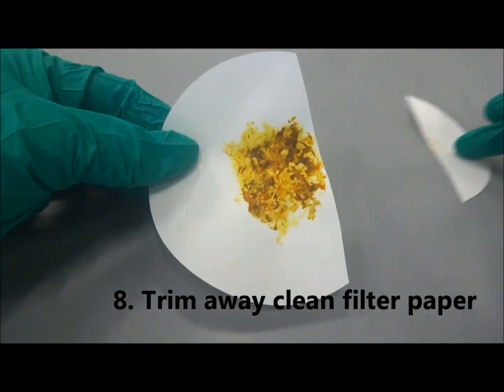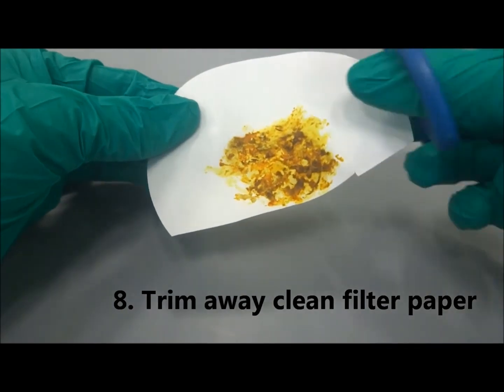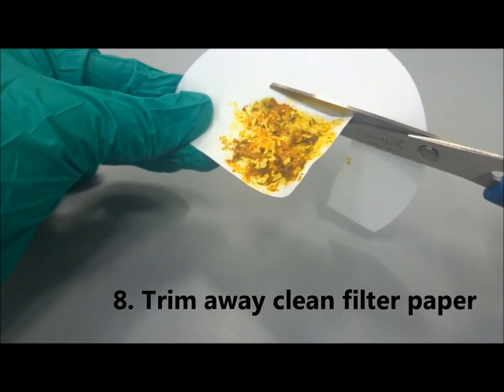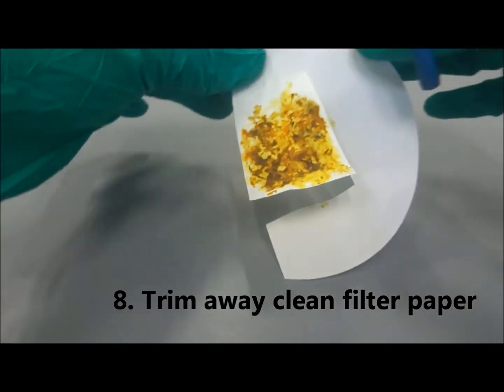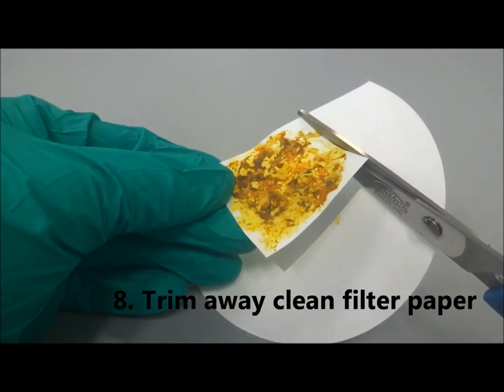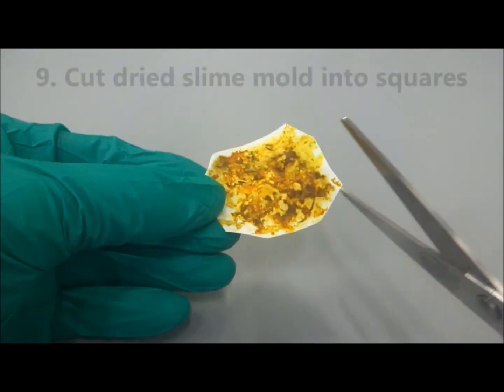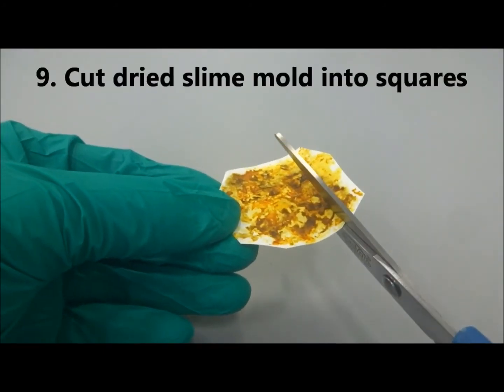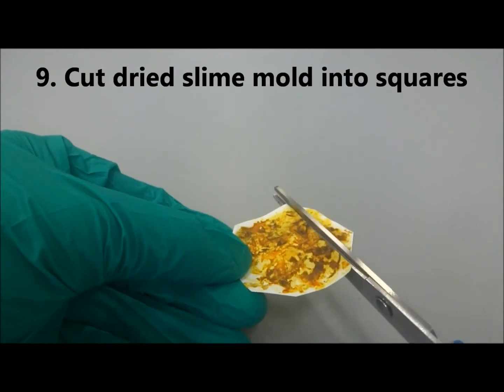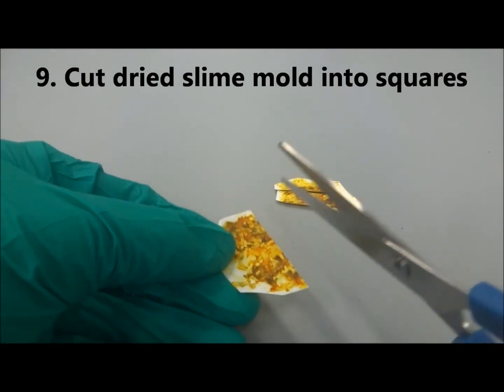Use a pair of scissors to trim away the excess clean filter paper. Next, cut the filter paper with dried slime mold into small squares that measure about 1 cm in length.